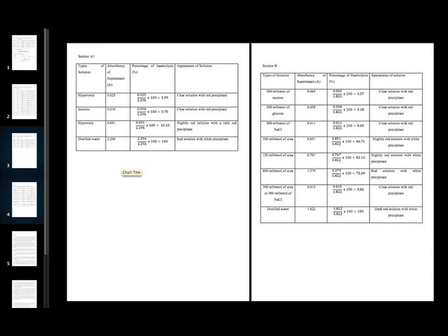In the first 4 test tubes containing 300 milliosmol of sucrose, glucose, sodium chloride, and urea, they are theoretically isosmotic to erythrocyte. However, when compared to section A1, only 300 milliosmol of sodium chloride is behaving as an isotonic solution to erythrocyte, whereas both 300 milliosmol of sucrose and glucose are neither isotonic nor hypotonic based on the value, or can be considered hypotonic if we really want to classify. This might be due to technical problems while carrying out the experiment, such as the precipitate at the bottom of the test tube being disturbed during transferring of supernatant into a cuvette.